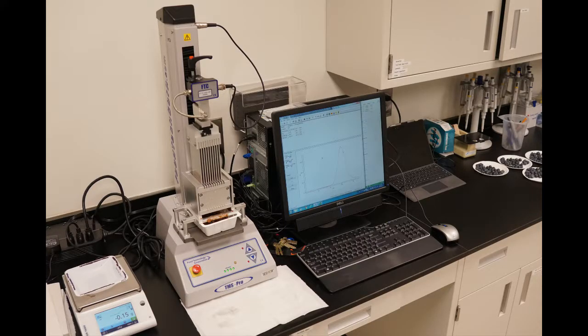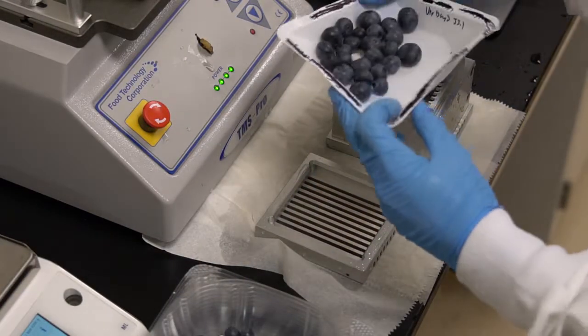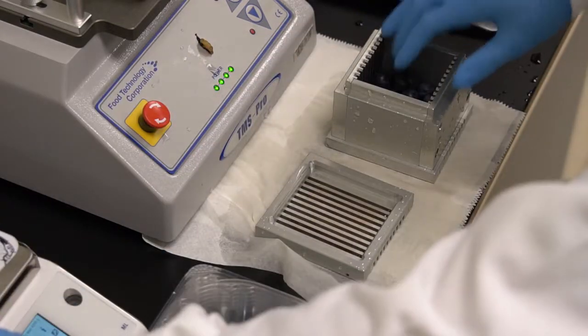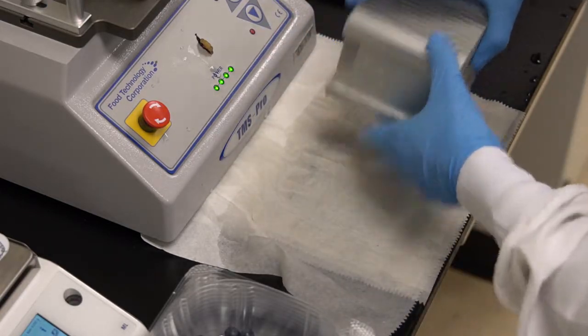This texture analyzer provides objective measurements of texture along with a texture profile. To measure fruit firmness, the Kramer-Shear test is used. This test correlates closely to what eating a handful of berries is like. A bulk, random sample of 50 to 51 grams of fresh berries is placed in a compression cell under shears that will compress the sample.